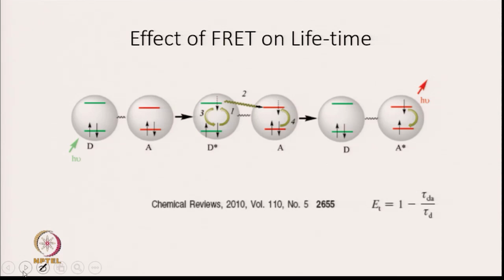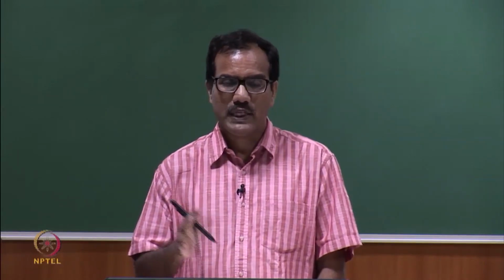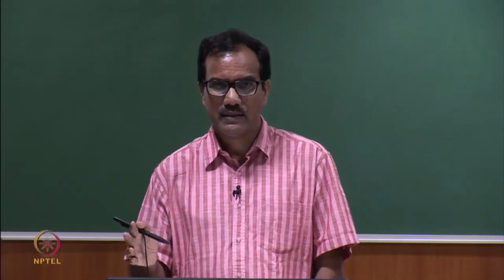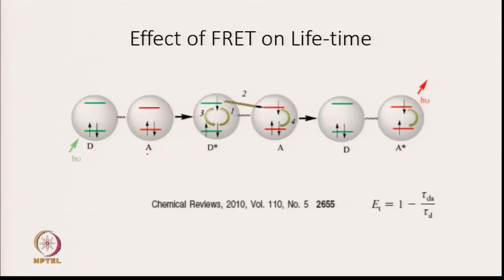Now, what we are going to see is the effect of FRET on the lifetime. This is important if I want to study the protein ligand interaction or protein protein interaction using lifetime measurement. So, now you see that this is your donor, this is acceptor. When you put light, then what will happen? It goes to excited state, it comes back, and there is a non-radiative transfer to acceptor.